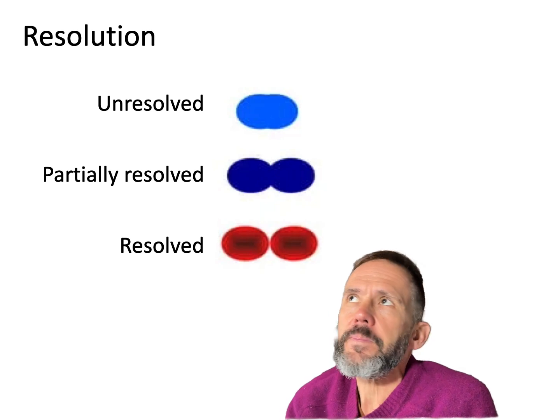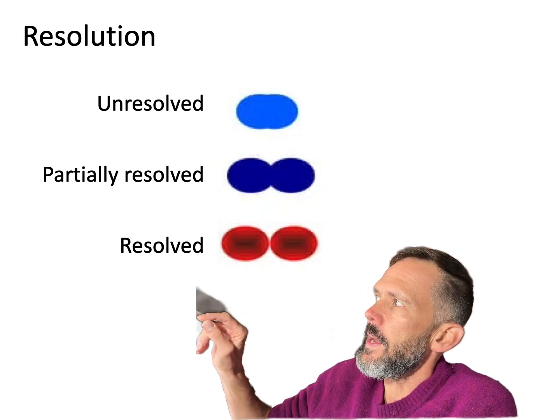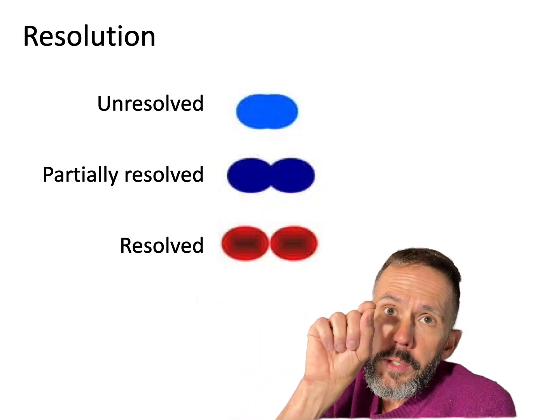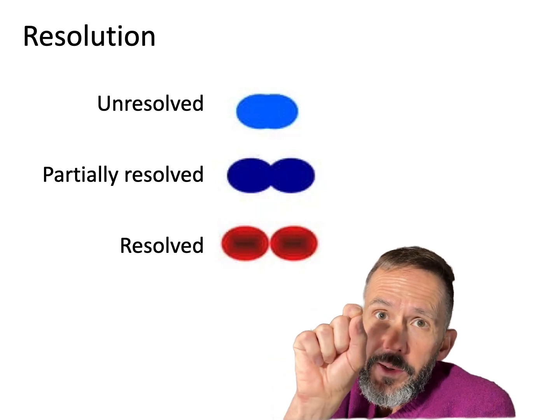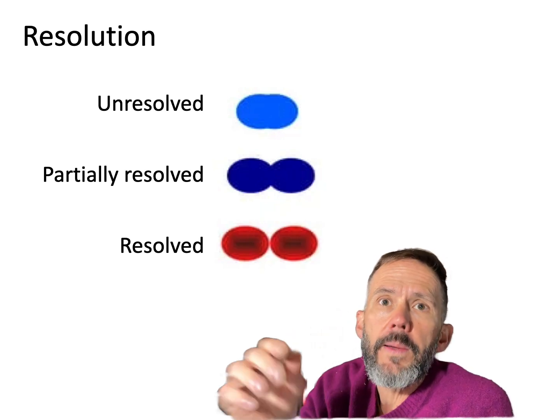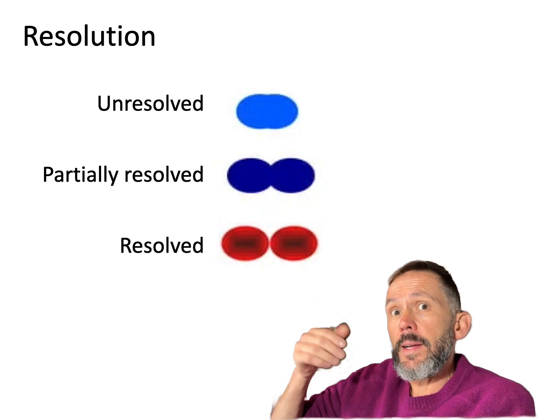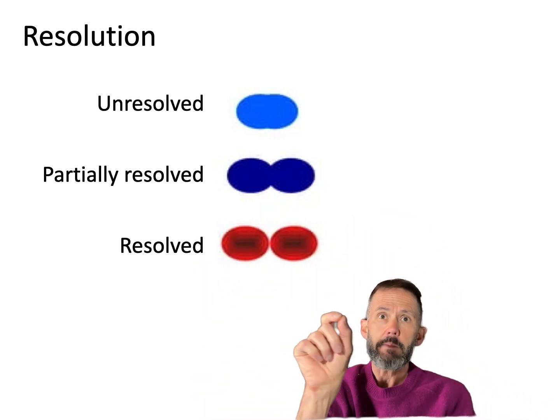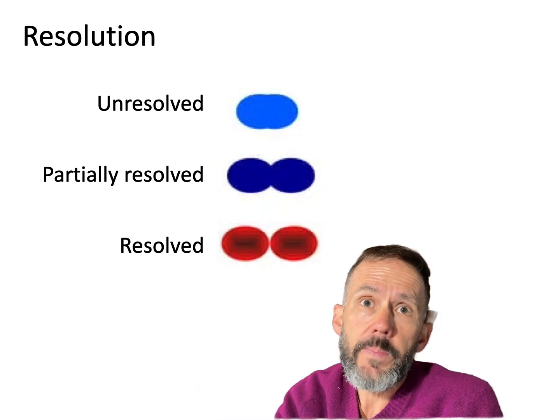Put another way, if you took a marker and put 2 little dots about 1 millimeter apart on a wall, you could do that right up next to the wall. As you start to step back away, what you might initially see as 2 points would start to blur together and become one. So you've lost that resolution.